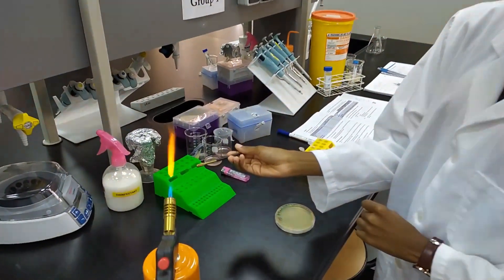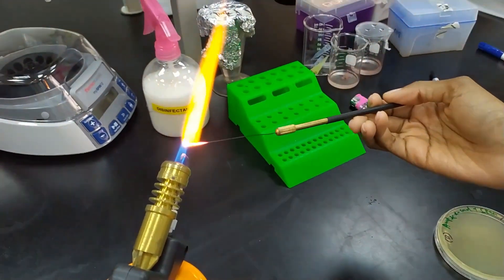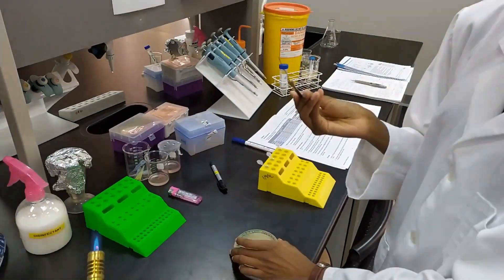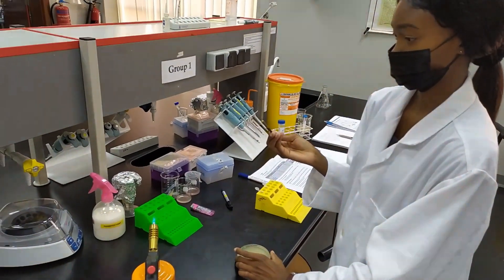First you will flame the loop. Make sure that you put it through the hottest part of the flame, which is the most blue. Hold it in there for a few seconds — it doesn't have to be very long, just long enough to kill off whatever might be on the surface of that loop. Then make sure that you cool it down before you use it to pick any colonies.